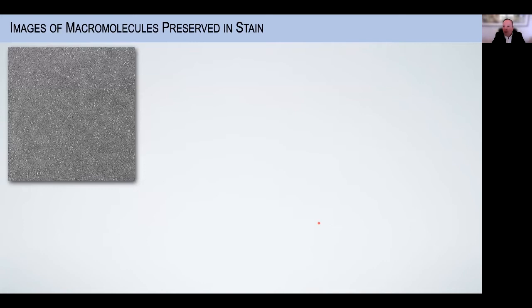So let me give you an example of what a new user of the cryo-EM facility will typically be faced with. The person would reach out to us. We would preserve their complex in stain, as shown here. This is an image from one of our microscopes showing several hundred particles of the complex of interest preserved in the stain.